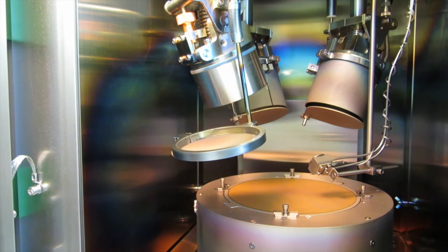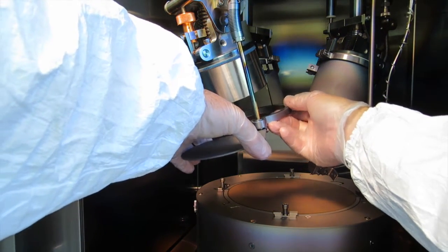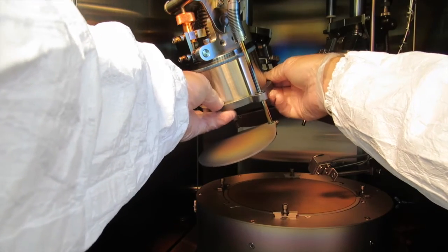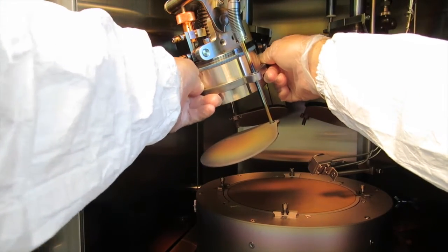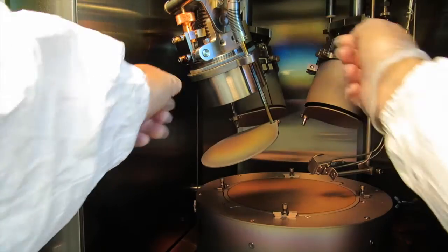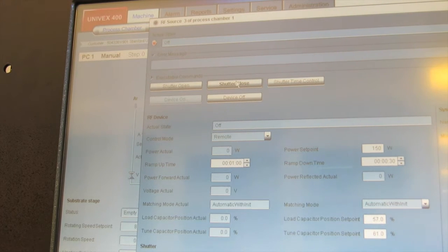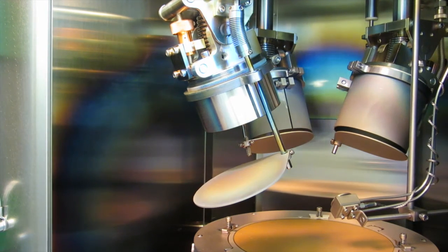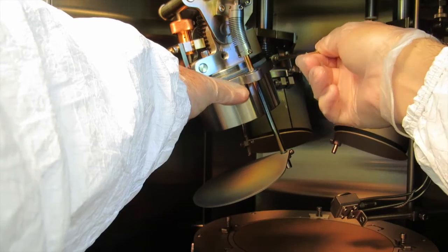Now it's time to slide up the ring which supports the shutter shaft. Just like when removing it, you have to be kind of gentle with it. And it's easier to rock it back and forth just slightly as you wiggle it up. There's a flexible joint at the top of the shutter shaft. And depending on where you put this ring, it will change the position of where the shutter is in the closed position. So to check that, you can close the shutter and see if it looks roughly centered under the magnetron. If it looks good, you can go ahead and tighten it up with the allen wrench. Just finger tight, you don't need to get this super tight.